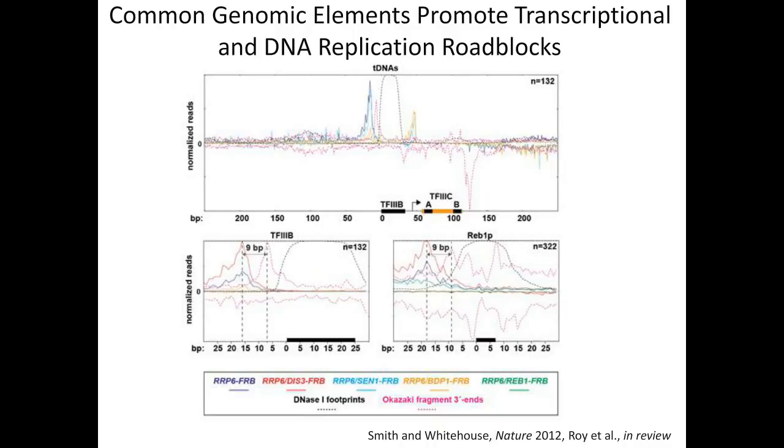Okay, so we use the RNA STAR alignment tool, and this is great for mapping RNA, and it's also recommended by Lexogen.